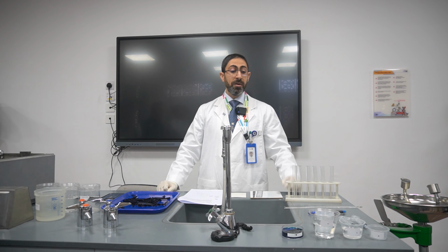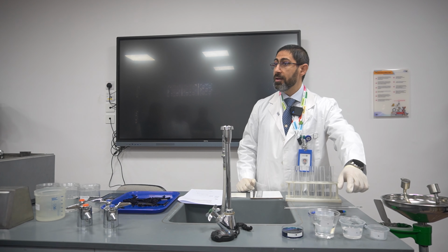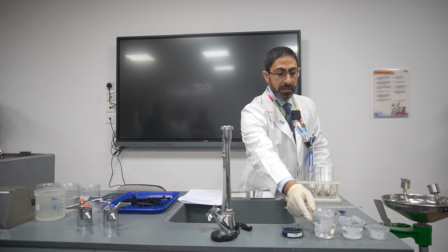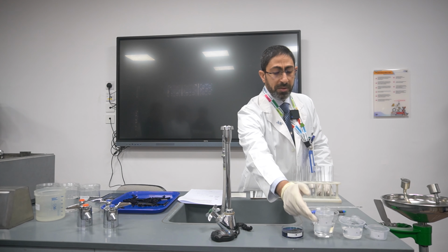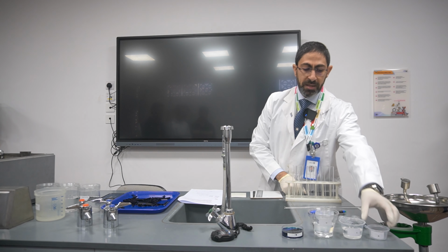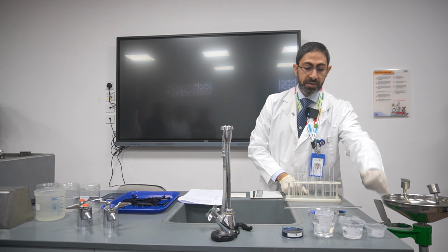First of all, we have 20 centimeters cubed of 10% sodium chloride solution, and here, labeled W, is distilled water, 200 centimeters cubed, and here we are referring to the record. You will write your recordings here.